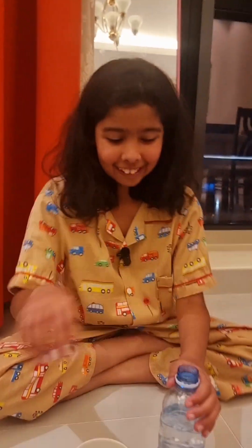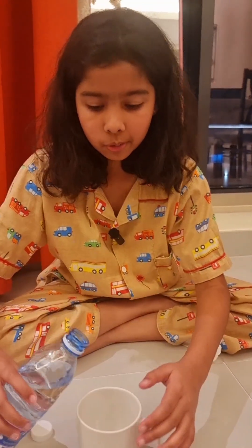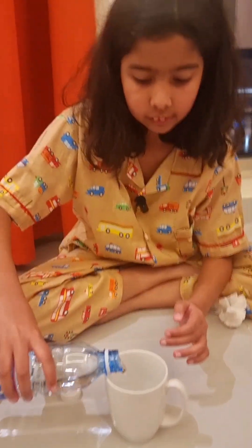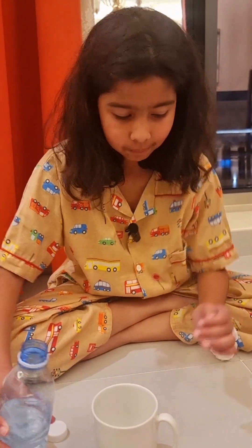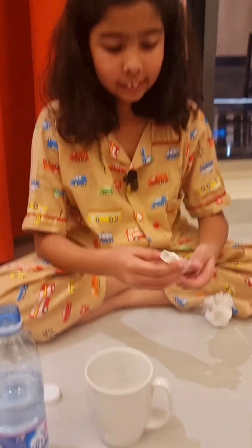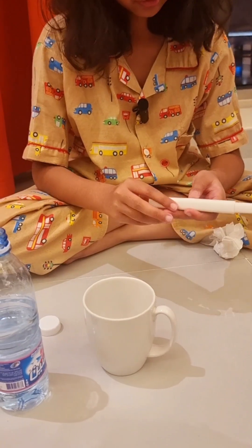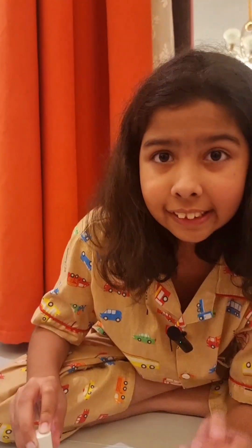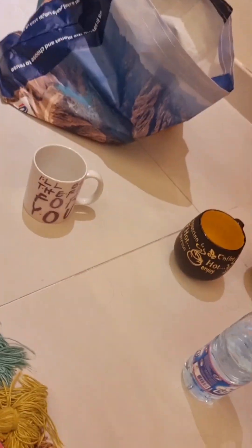Now let's see Sunneen. Let's pour you in. Let's check you out. Sunneen, you are 139. That's pretty good, Sunneen. Not so bad.